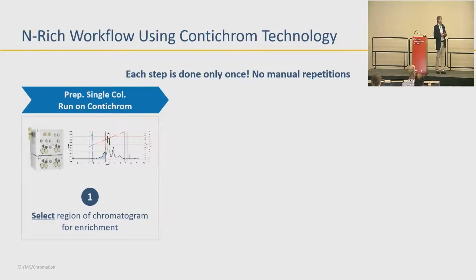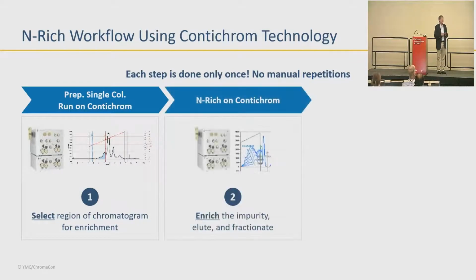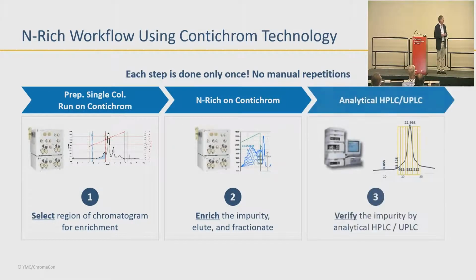So basically, this is the overview of the three-step process. You start with chromatography, and it doesn't work with bad chromatography, so you need some separation. If your material's not separated, then really no chromatography is gonna help you get it pure.